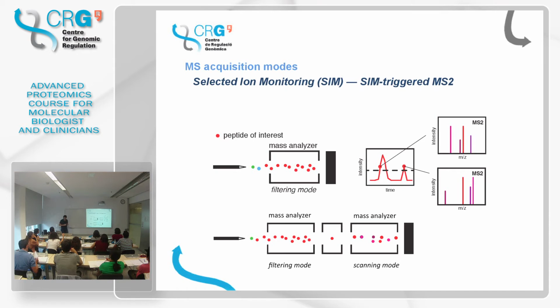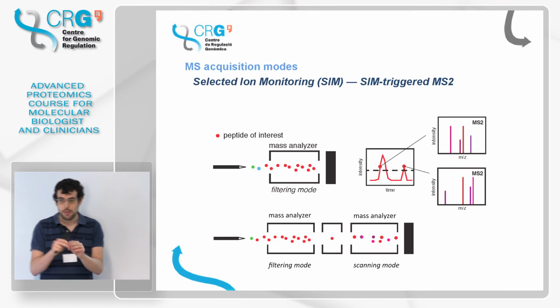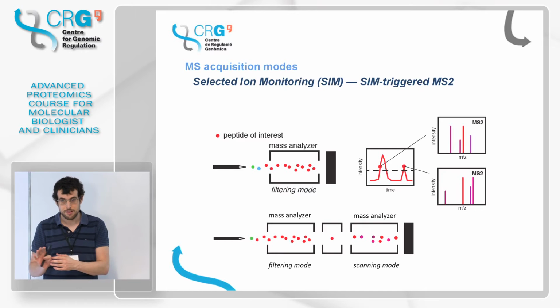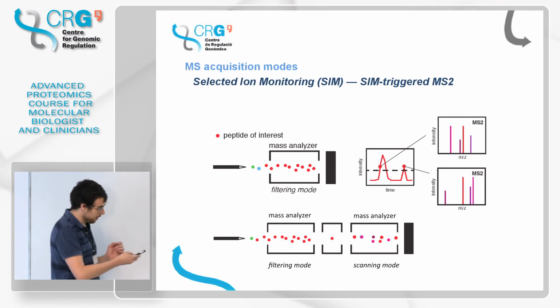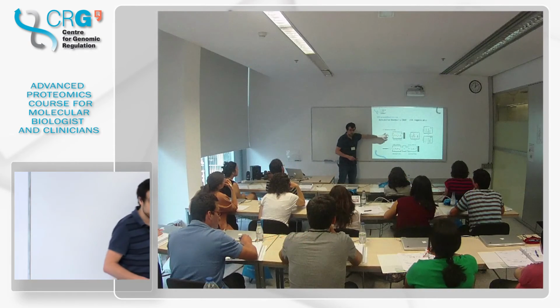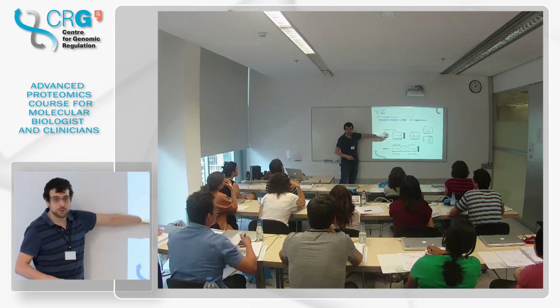Yeah, this is a dynamic process. The sample is continuously getting into the mass spec, so I have to do things very fast, because otherwise the sample is not there anymore. While I'm monitoring things and this is reaching the detector, very fast I have to stop this acquisition mode, switch to this one to get this, and go back to this.